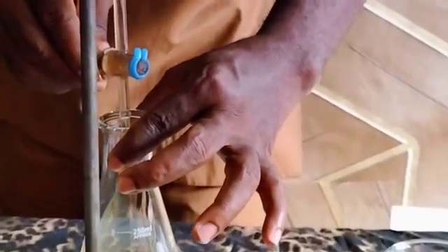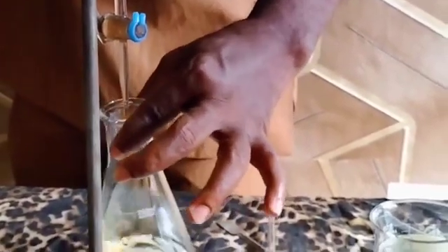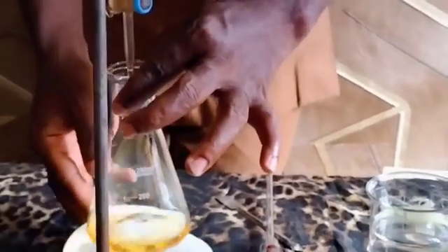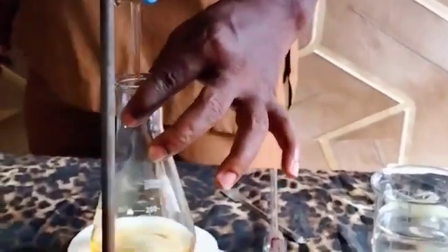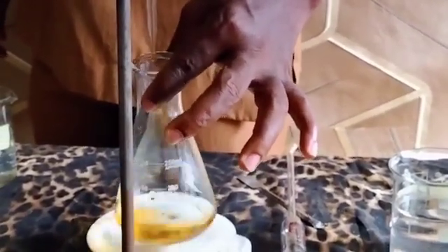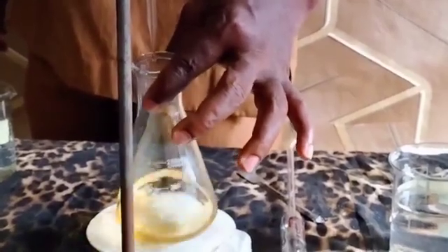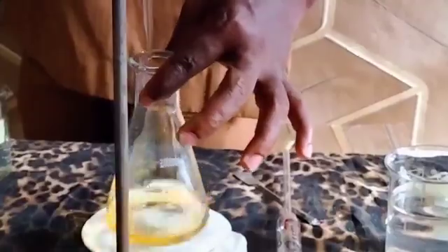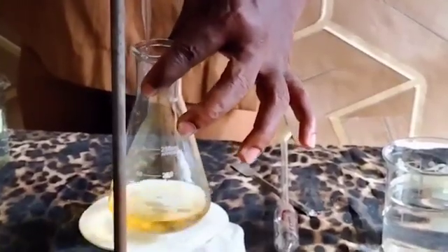You can increase the drop. Because this is the first one you're doing, you have to be very careful of the color change. So you can use a white tile under, but we're using an improvised white tile, using a filter paper. You can still use an A4 paper under. So the essence of the white tile is to know when the color changes for accuracy, so that if the color changes, it reflects on the white tile.